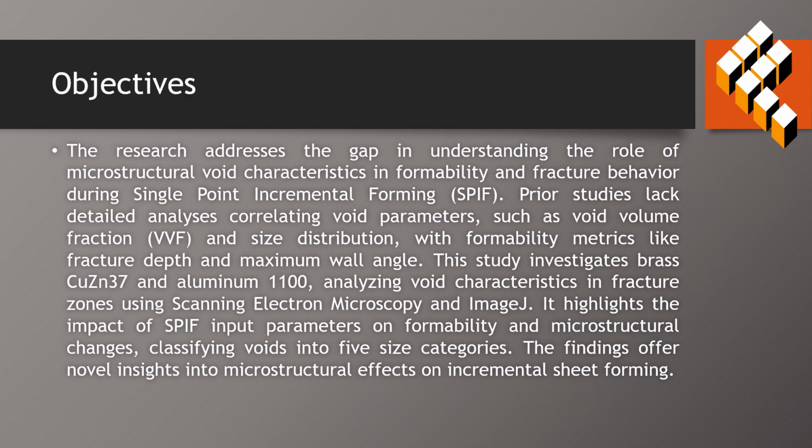Objectives: the research addresses the gap in understanding the role of microstructural void characteristics in formability and fracture behavior during single point incremental forming. Prior studies lack detailed analysis correlating void parameters such as void volume fraction and size distribution with formability metrics like fracture depth and maximum wall angle.